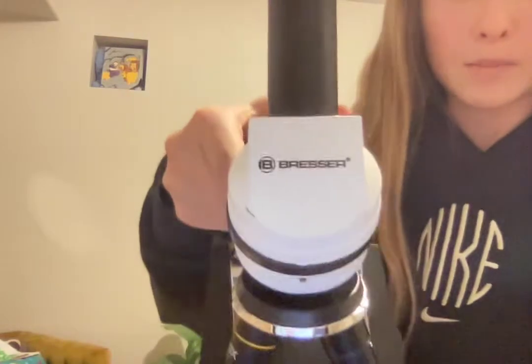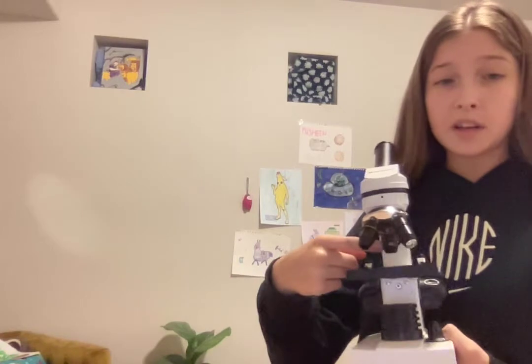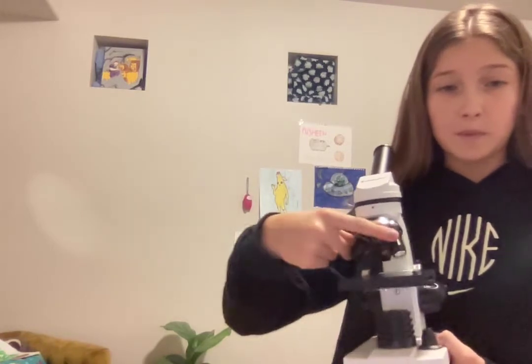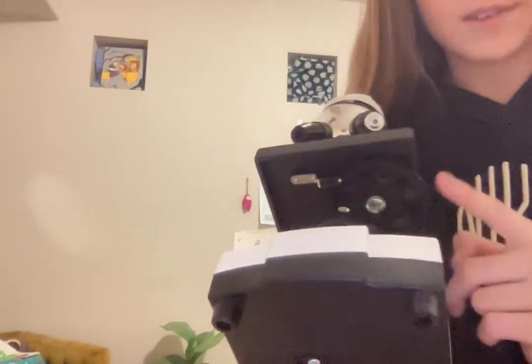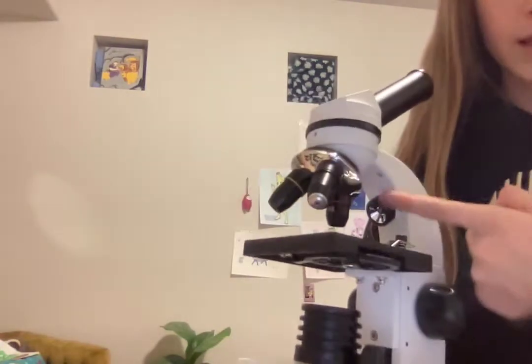This is a Bresser microscope. It's really nice. It goes up to 4 times, 10 times, and 40 times magnification. It has light color filters and three power settings for the light.